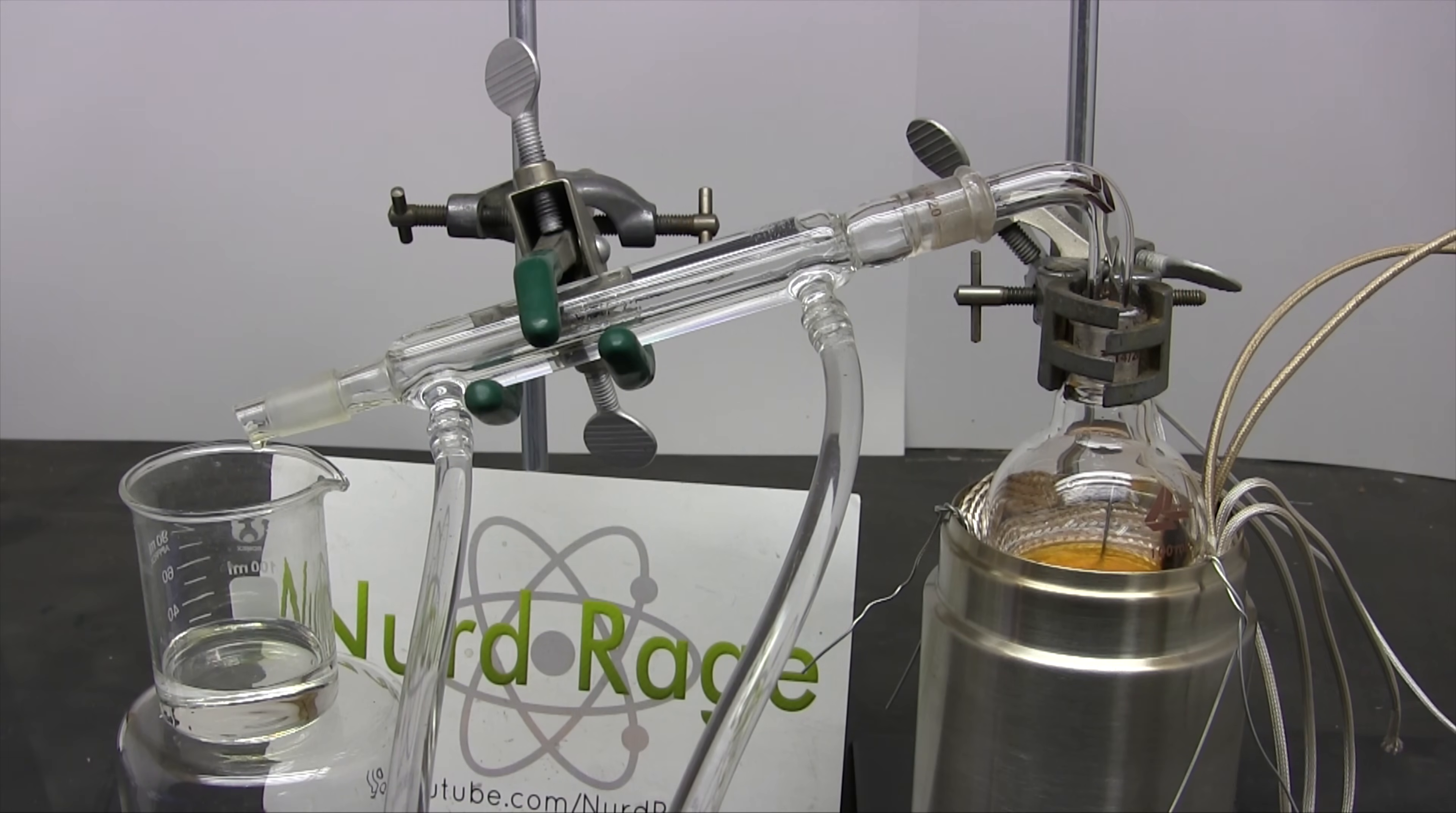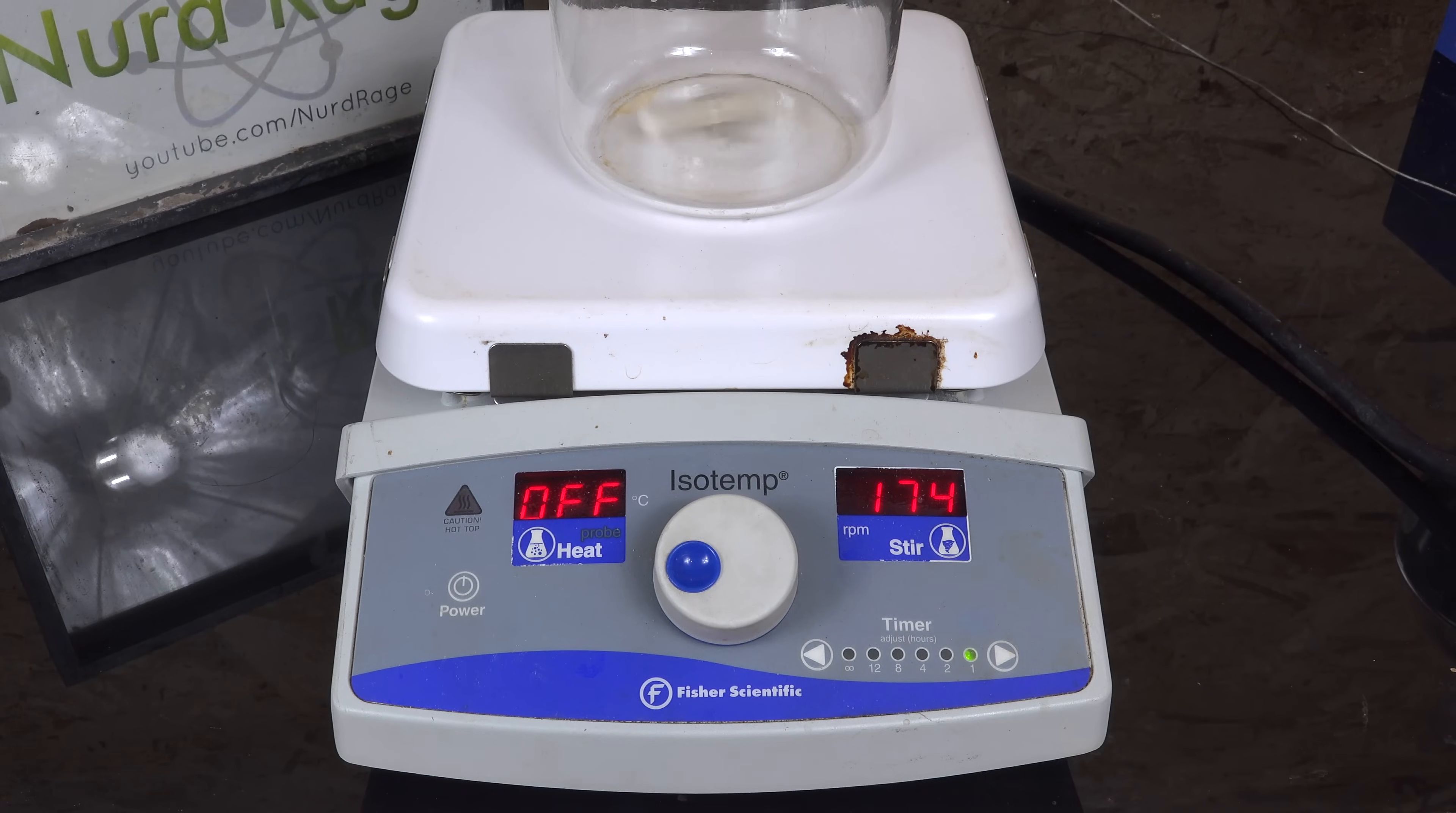Another problem with the mantle is that there is no stirring and so bumping and splattering was a problem even with boiling chips. But stirring practically eliminates bumping. This ceramic hot plate stirrer does both.